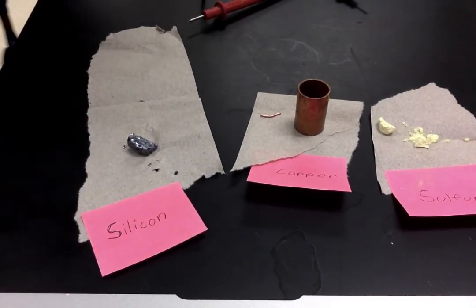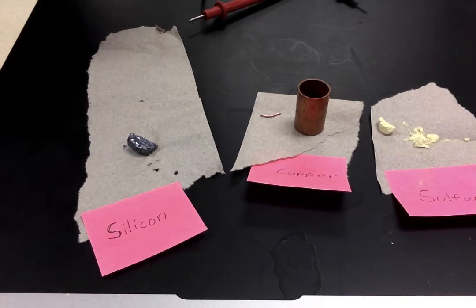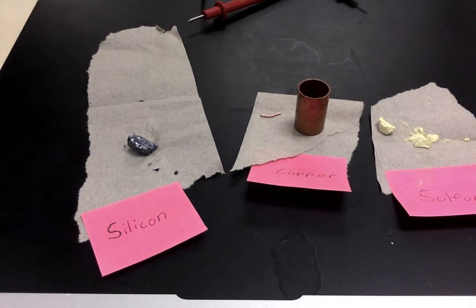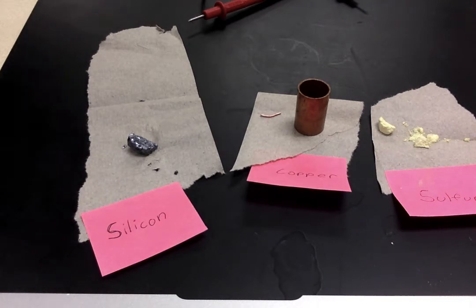Okay, so what does that mean? Well, if a substance is ductile, that means that you can shape it into a wire. So one of these substances you can see is shaped into a wire. And then for the other two, you can sort of use the malleability experiment to guess how easy they would be to shape into a wire, right? Typically, the more brittle something is, the tougher it's going to be to shape into a wire. So which of the other two was the most brittle?